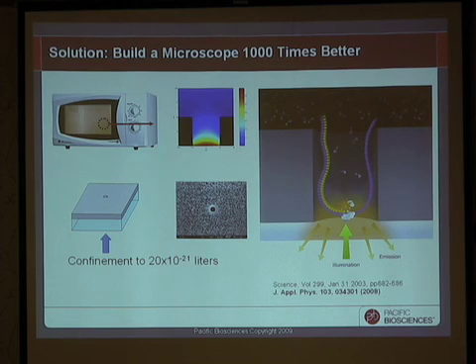The reason it works is because the microwaves are about 12 centimeters in wavelength, and the hole is about 2 millimeters in diameter. And because of classical electrodynamics, a photon with a wavelength that large simply can't go through such a small hole.